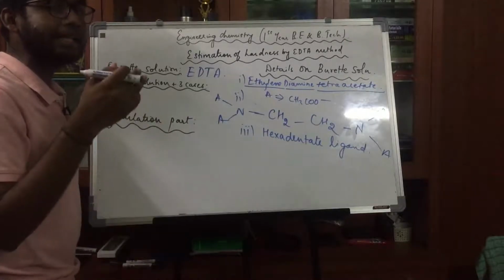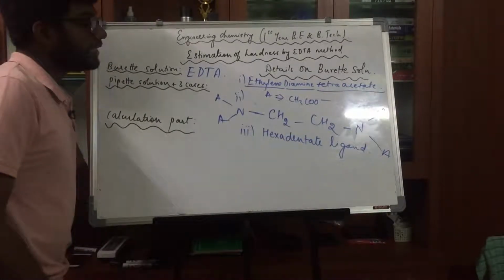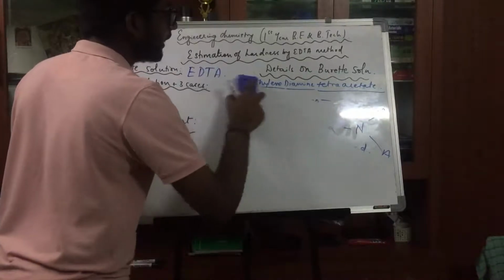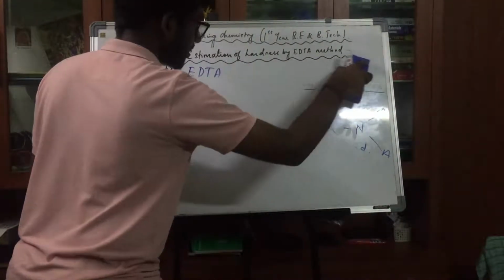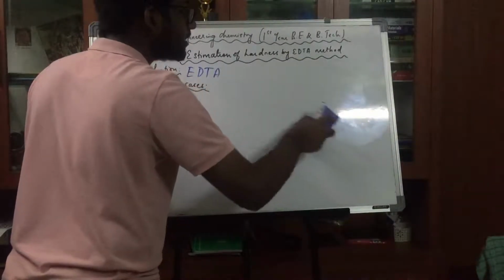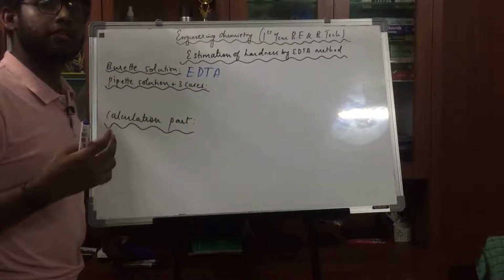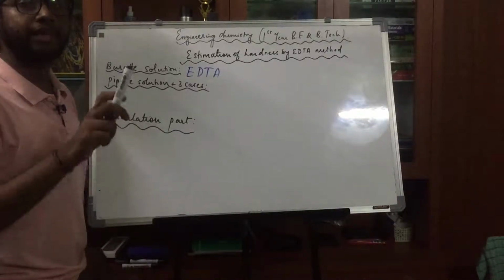These are the details regarding the burette solution, and next is your pipette solution. The burette solution is EDTA, and the pipette solution will differ depending on the case. There are 3 titrations to carry out to determine the temporary hardness, permanent hardness, and total hardness. But the first titration has a different purpose: to determine the concentration of EDTA.